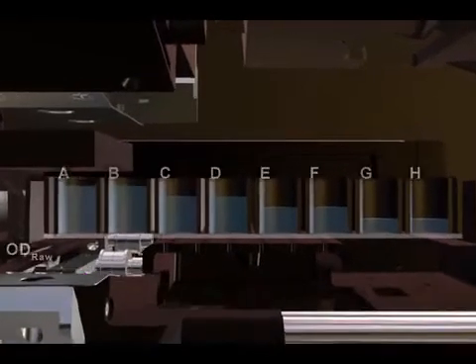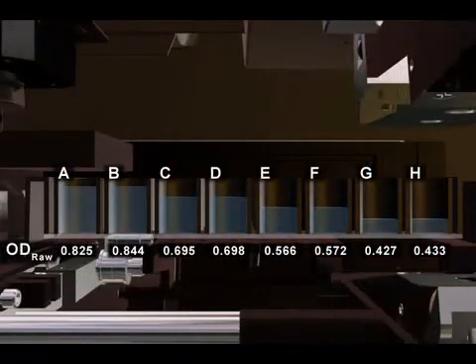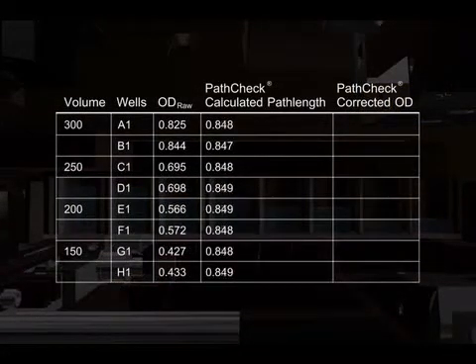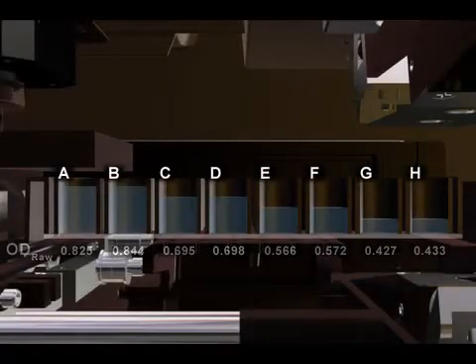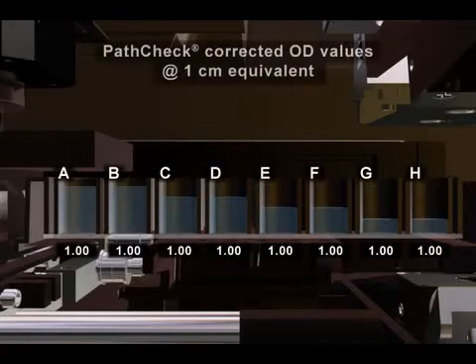In addition to your raw OD value, PathCheck reads the wells at the temperature-independent absorbance point of water to determine the actual path length. This path length is applied to the raw OD values to convert them to the OD value if it were one centimeter. You can correct for differences in volume and get better quality data with this patented feature that is unique to molecular devices readers.